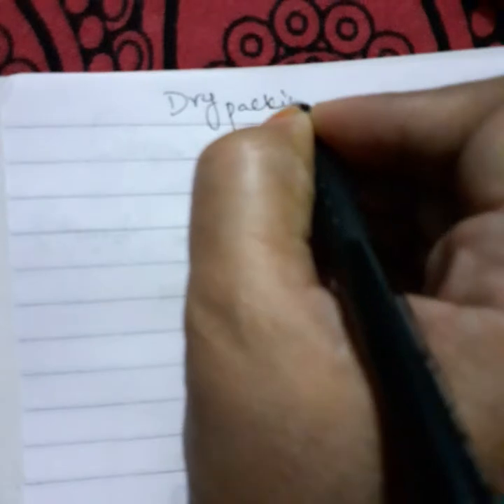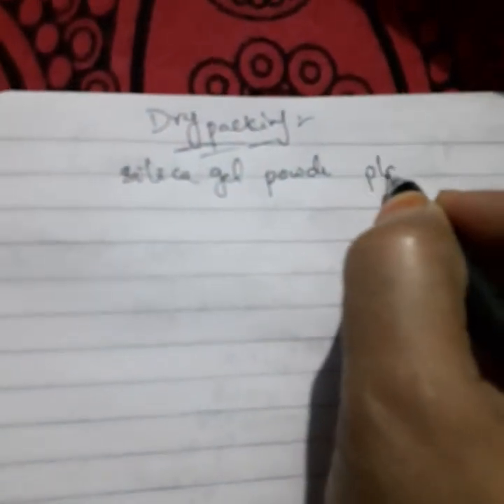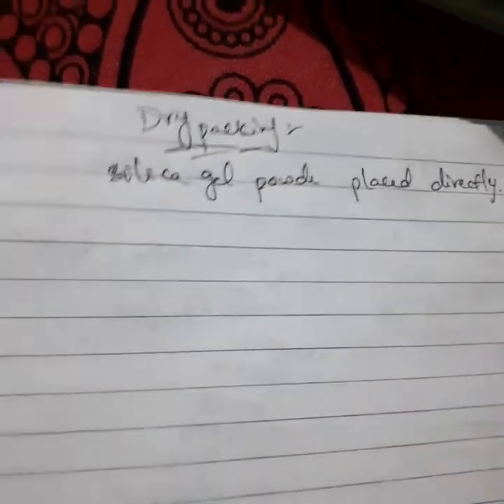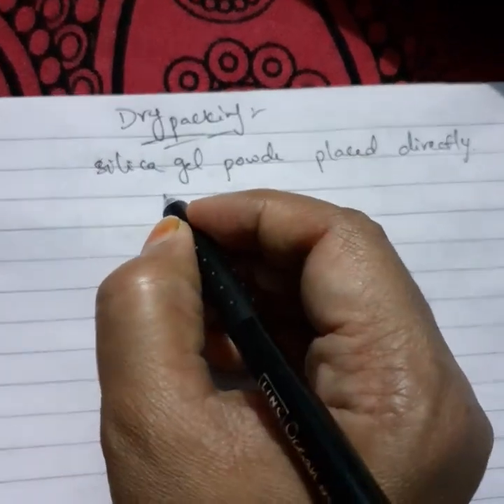So this dry packing method in column chromatography, what we are doing. So silica gel powder is placed directly into the column. Now we need to add that reaction mixture, right?